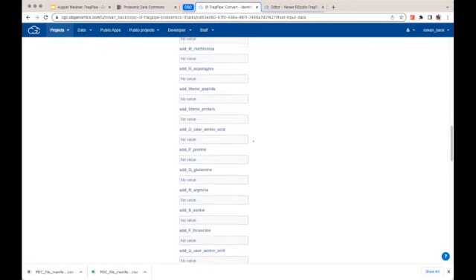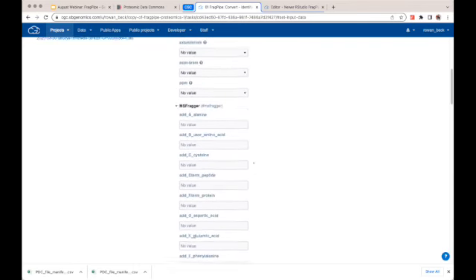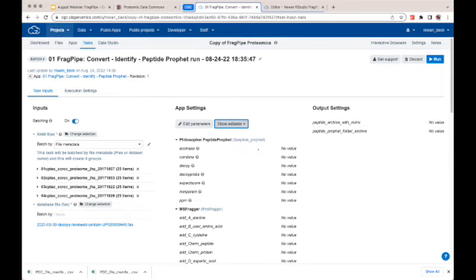You're going to scroll down, and there is one thing that you will need to, if I can find it here, there's an agreement that you need to accept. Oh, but because it's a public project, I think it's already been accepted. So that makes sense. If you're doing this from scratch and adding it, there's just one drop-down menu here that you have to click yes.